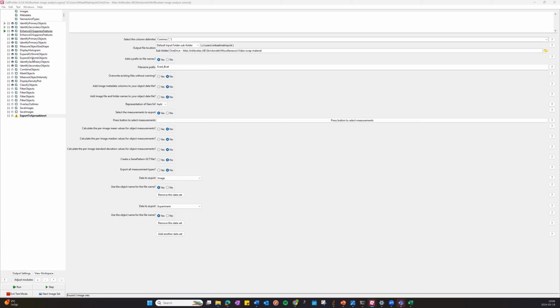And basically according to the instructions I gave you earlier for cells, and you can then set the thresholds based on your tissue staining images. So I won't do that now because I know that my settings are good for tissue. So I will just exit test mode.